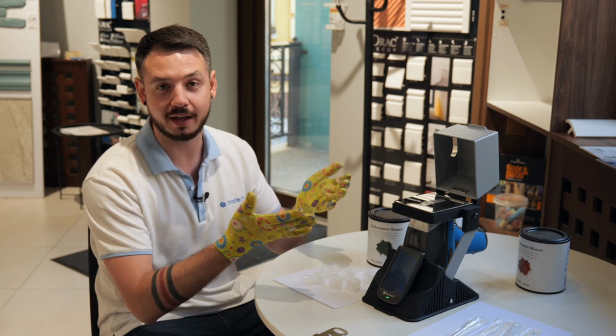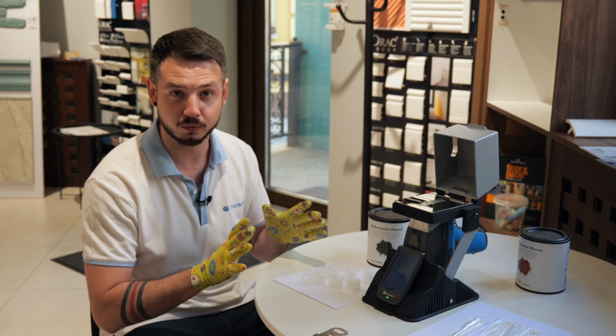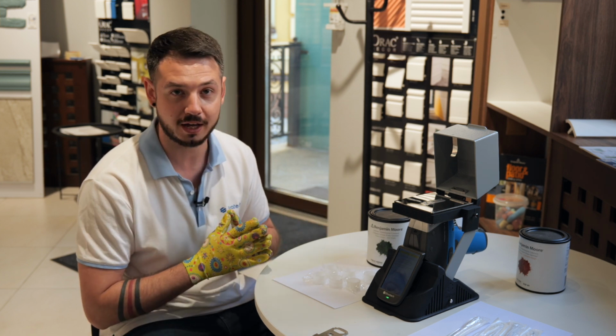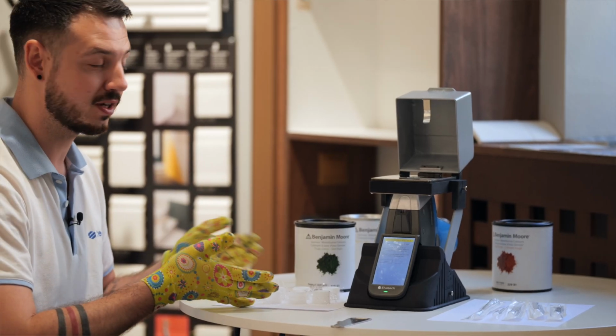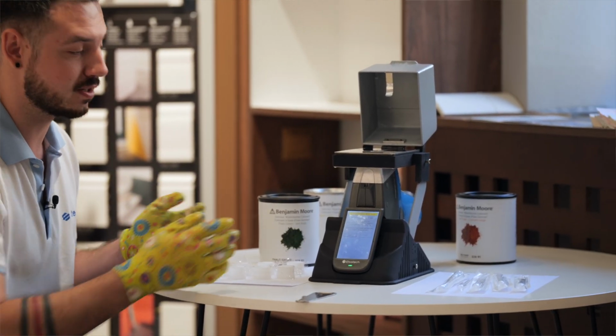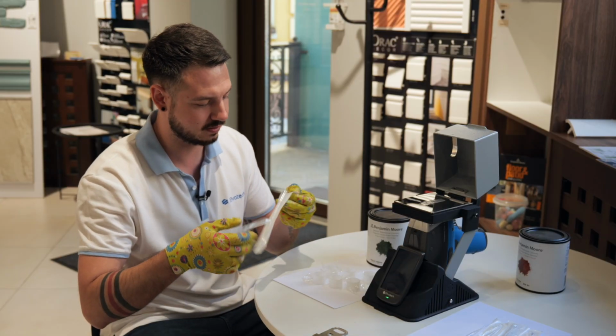First of all, we have the analyzer itself, positioned on a lab stand, which will be helpful for measuring in the sample cups. We have the paint, the sample cups, and the pipettes. So let's get ready for the analysis.